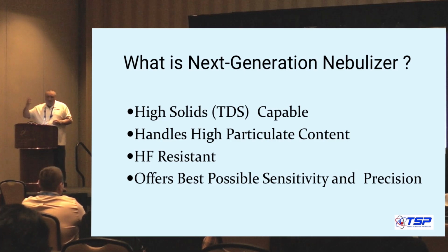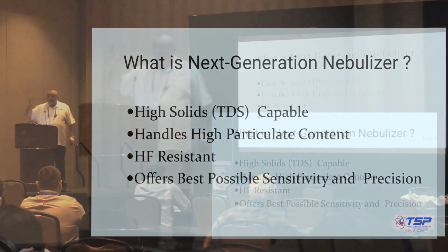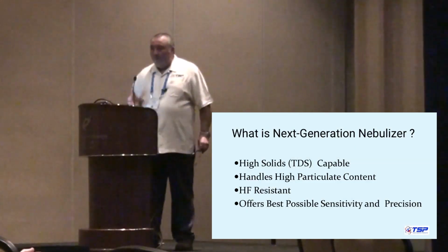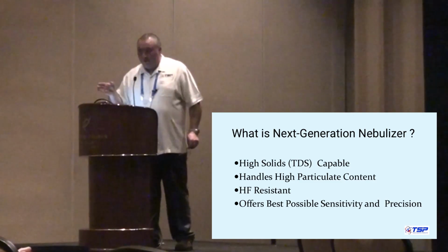So the dream nebulizer I was talking about, right? If you summarize, it should be high solids capable, handle particulates, be HF resistant, but also the key thing there, because there are nebulizers on the market that do all of that, but at the same time, to get the sensitivity that's been shown by Thomas and Melissa with her 4 ppb detection limit, and the precision.